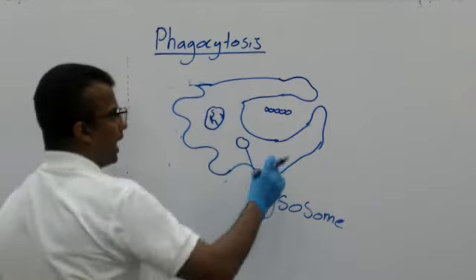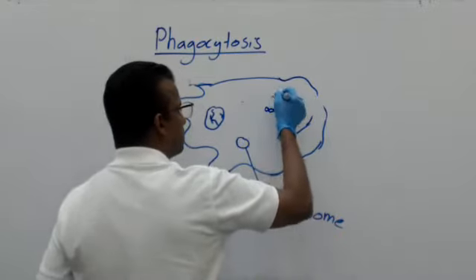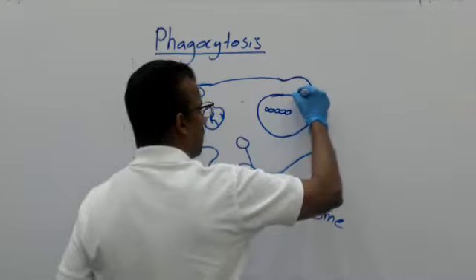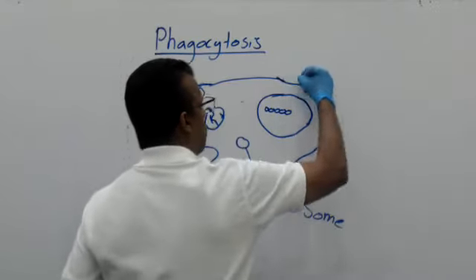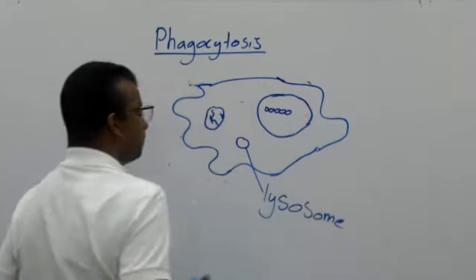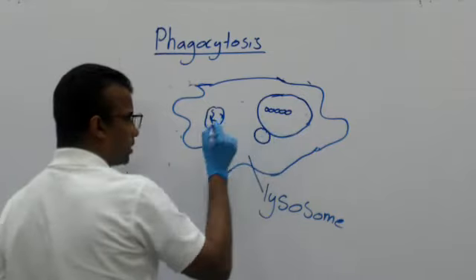Okay. And at one point, this bacteria is trapped by the pseudopodia extension, and the lysosome would have also attached.